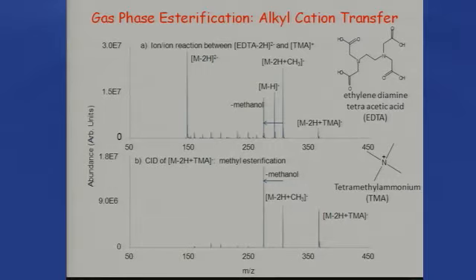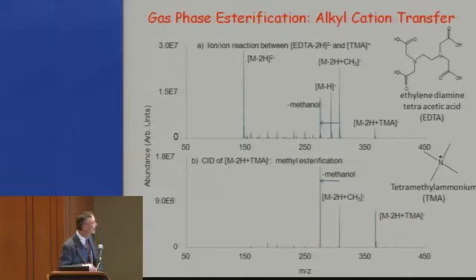There's another idea that we had that came out of a discovery that we can methylesterify or alkylesterify peptides and proteins in the mass spectrometer if we use quaternary ammonium compounds as reagents. So this is just EDTA. If you react doubly charged EDTA with tetramethyl ammonium, you see an adduct here.